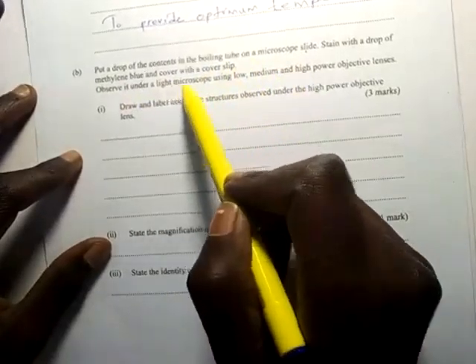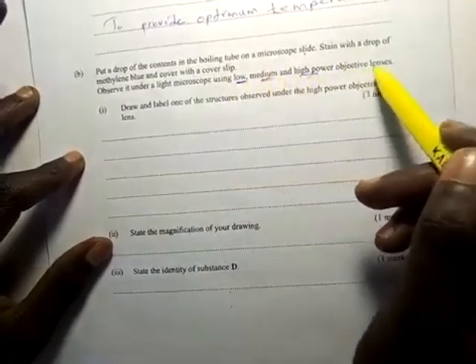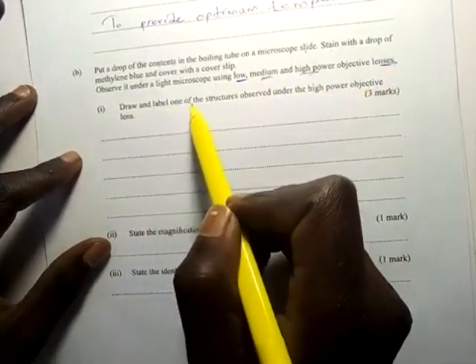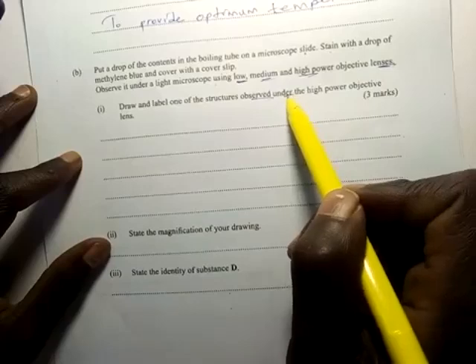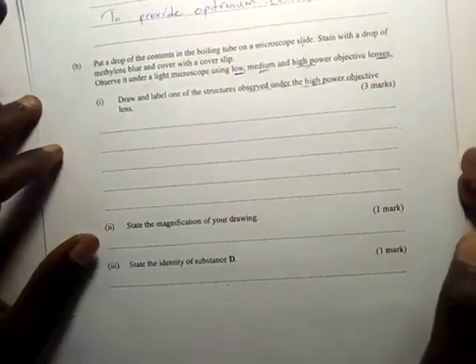Observe it under the light microscope using the low, medium and the high power objective lenses. Draw and label one of the structure observed under the high power of the objective lens. Now, for us, we don't have the microscope, but I will do for you the expected observation.